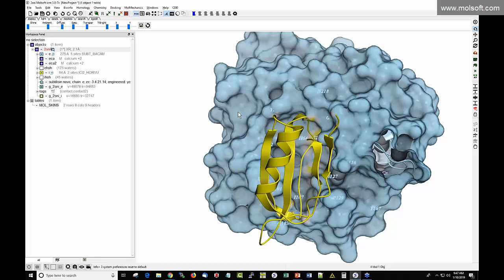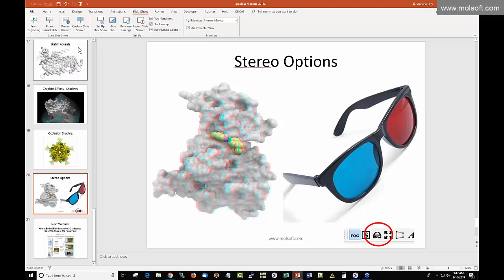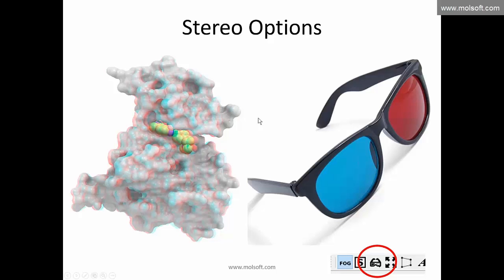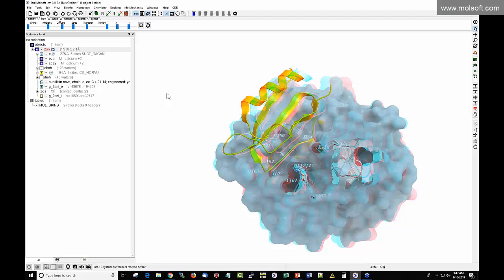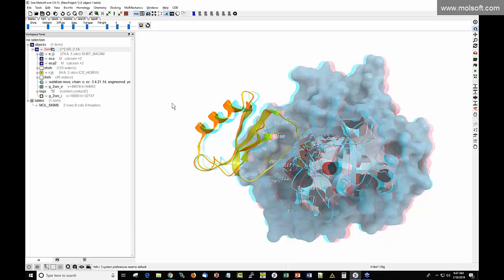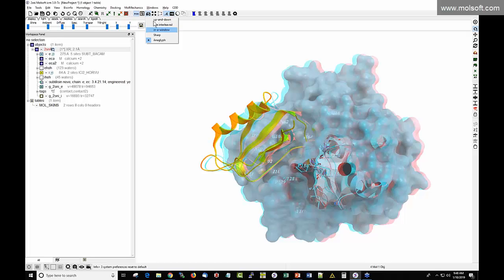Finally, ICM supports stereo display. The options are in the glasses button — click-and-hold to see options depending on your hardware stereo setup. For a cheap option, anaglyph stereo works with red-blue glasses available for about $3. Click-and-hold the glasses button and choose 'anaglyph' to enable it. If you have the glasses on, the structure is projected in stereo; without glasses it will appear as a colorful mess. Toggle it on and off as needed.